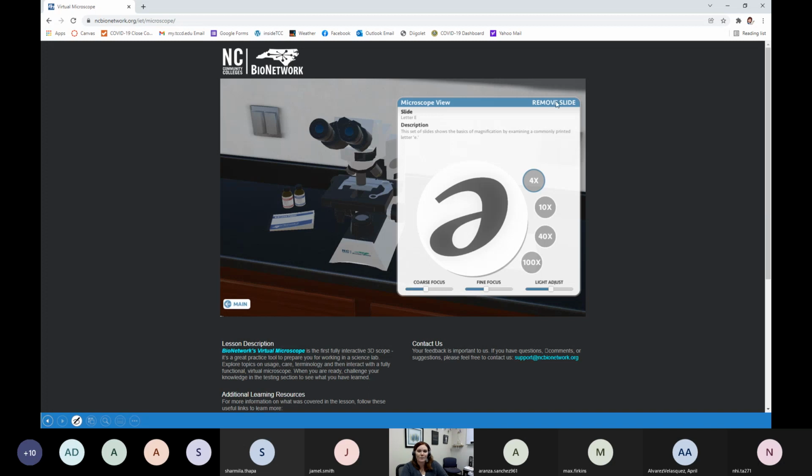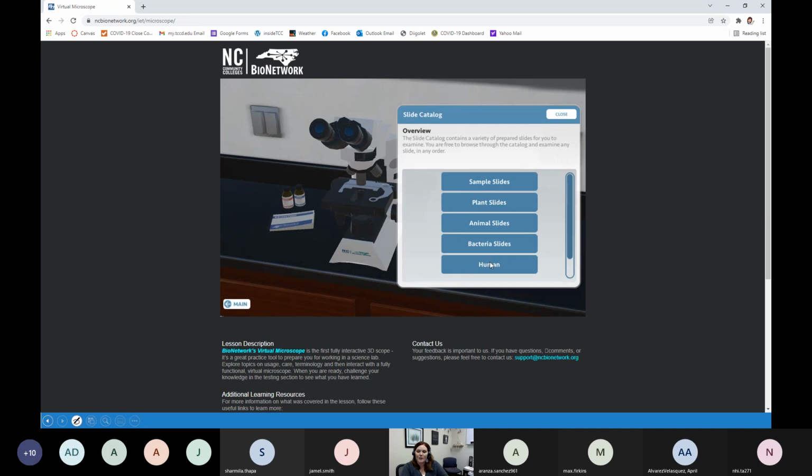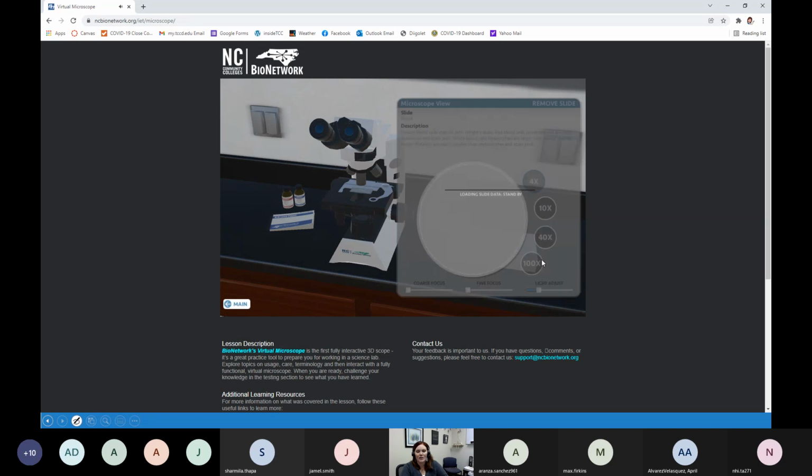Let's do one more slide briefly just to show you. We're going to go ahead and do a human slide. We're going to do a blood smear just because this one's easy for us to look at.